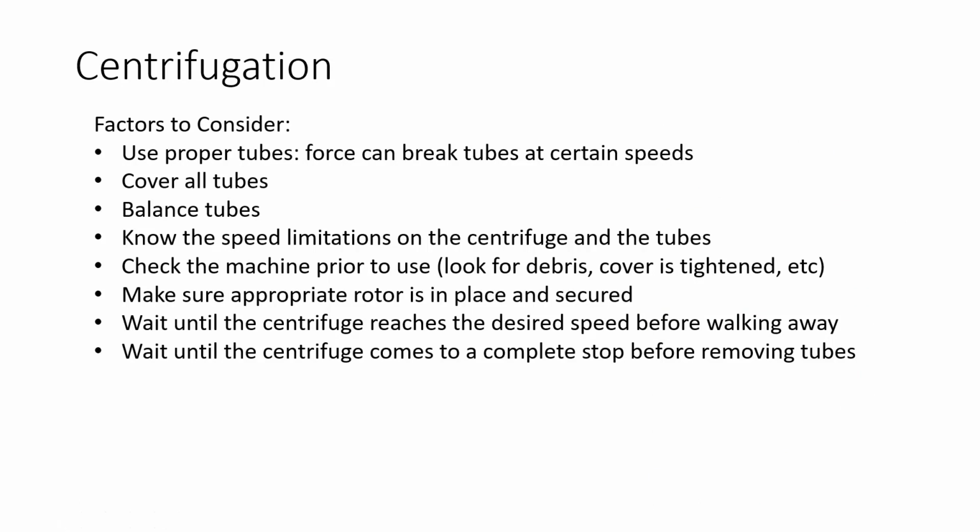Know the speed limitations on the centrifuge and the tubes. There's a lot of different centrifuges out there, and if a protocol says that you have to have a particular RCF for this test, you want to make sure to select the centrifuge that can withstand that type of speed. Check the machine prior to use. You always want to look for debris, make sure that the cover is tightened, etc.